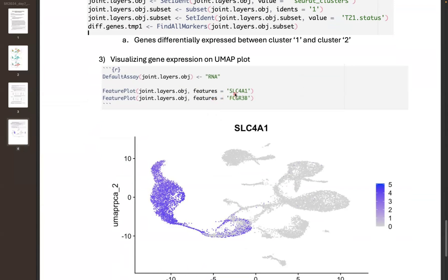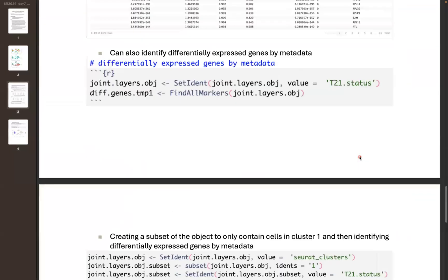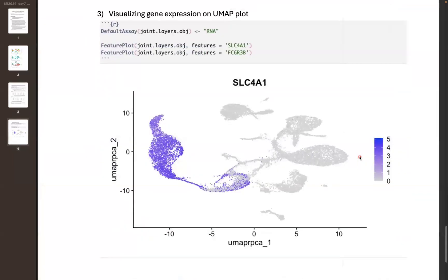In this case, I found the gene SLC4A1 and found it was highly expressed in one particular cluster and a bit more in another group. We can go through genes from this list and plot them to visually verify that they are actually expressed in those clusters. When I look at this FeaturePlot, this gene does a very good job at distinguishing cells in one quadrant of the UMAP relative to basically all other clusters — it seems very distinctly expressed in that one cell type.